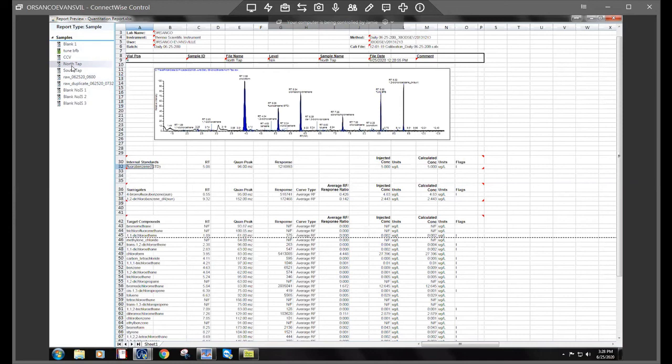And you can sometimes run like four drops of methanol mixed with DI water in a 40 mil vial. And you could run that a few times with some blanks through your whole system, like through your Purge and Trap and then into the GC.